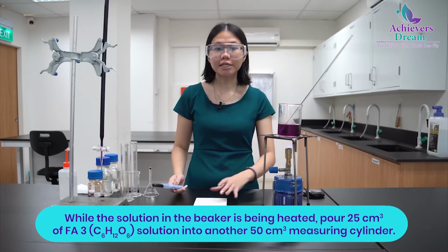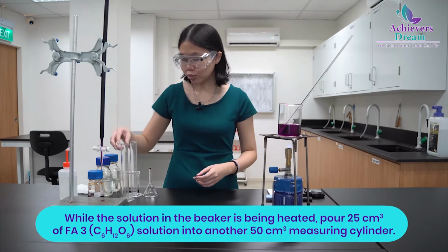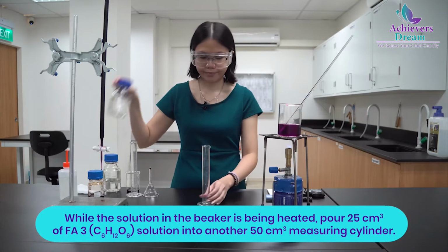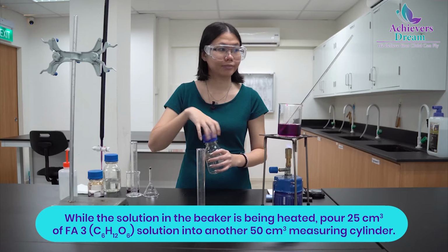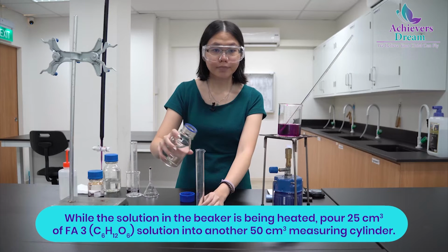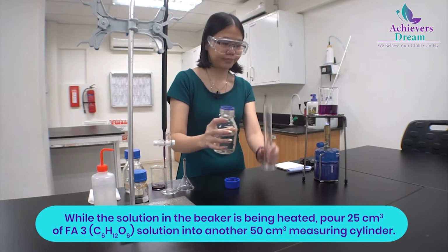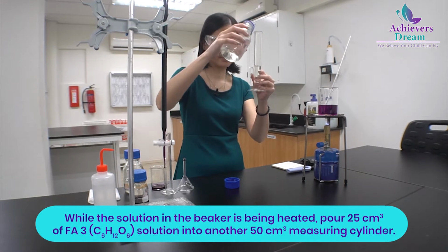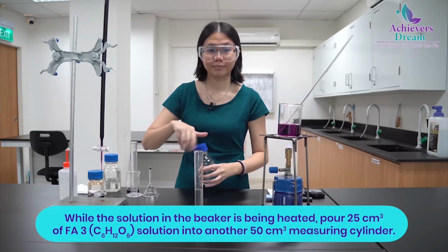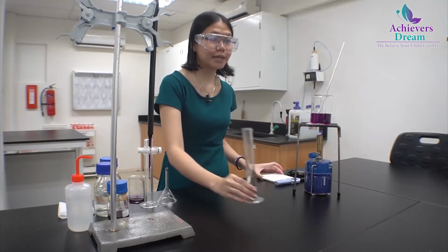Okay, while the solution is being heated, measure 25 cm3 of your Fa3 solution, which is your glucose solution, using another measuring cylinder. Measure around 25 cm3. Okay, and set this aside.